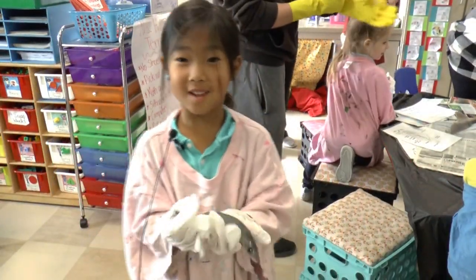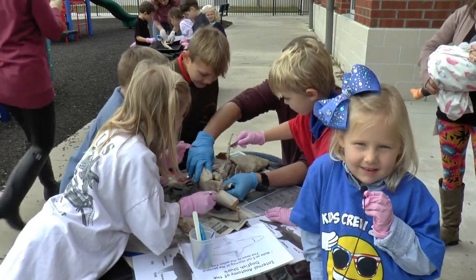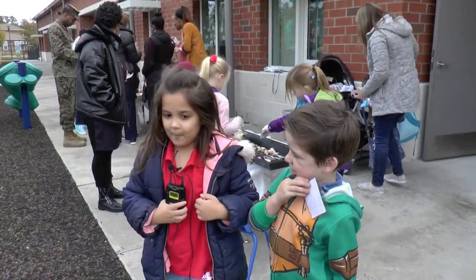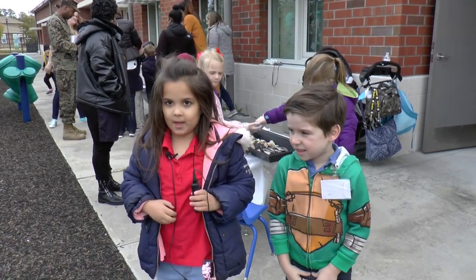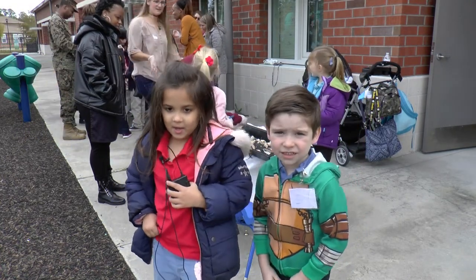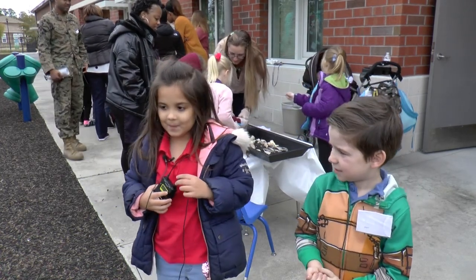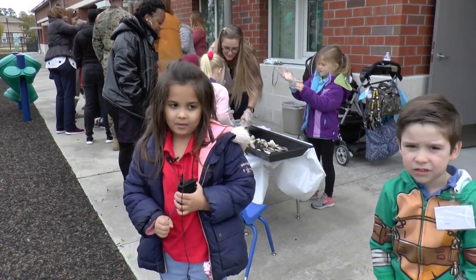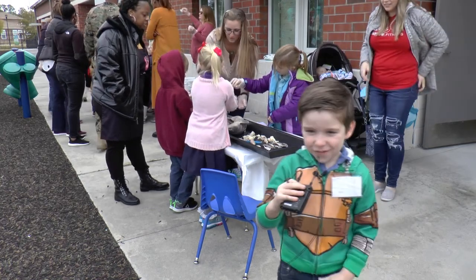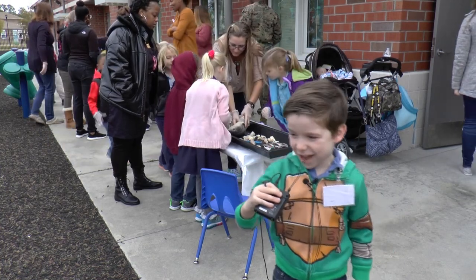We have a girl shark and inside we found a baby shark. We're taking out babies. Yeah, good job. I found babies and the mommy had food in it. It had a stomach and there's teeth in the mouth. There's lungs and the mama shark had a tail. I found babies.